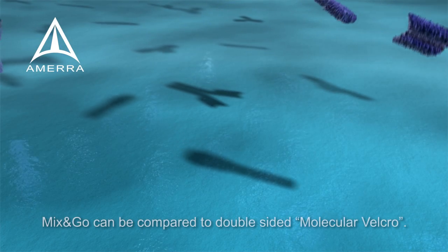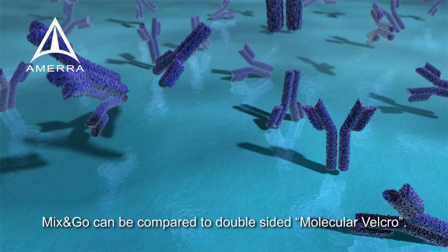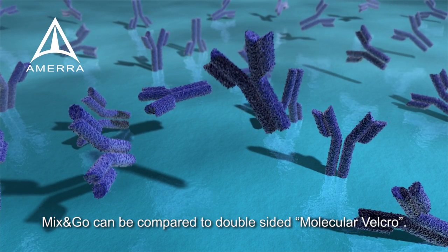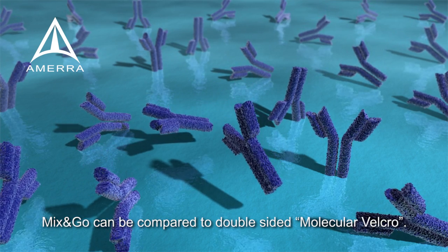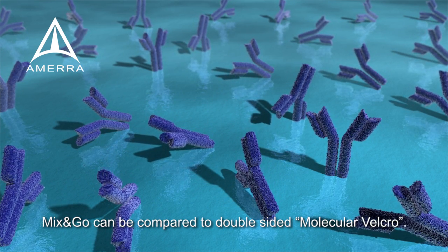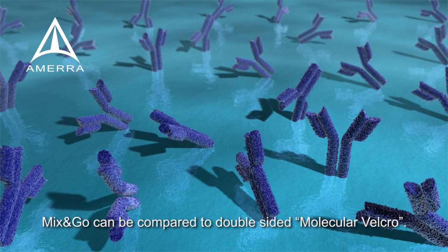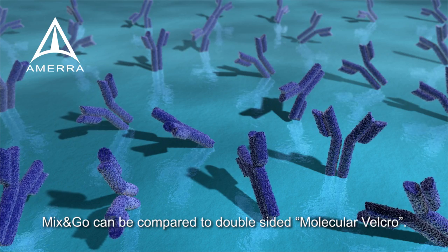Here you can see a surface coated with Mix & Go, which is an aqueous solution containing polymeric metal ions. When an antibody is added, these metal ions bind them via chelation. Each of these binding events is flexible and can stretch, break, and reform to accommodate the biomolecule and avoid damage to it.